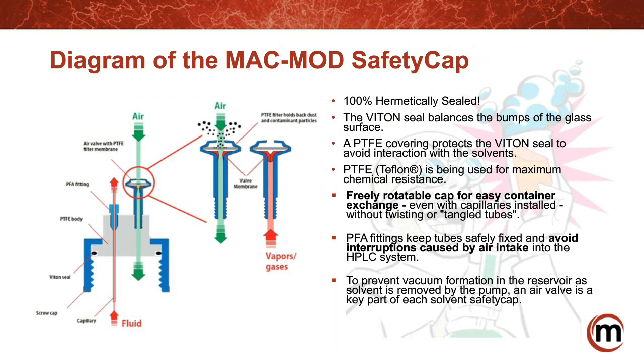So here we have a diagram of the MACMOD safety cap, and it's made up of the screw cap, the PTFE body, the air valve, and the PFA fitting.